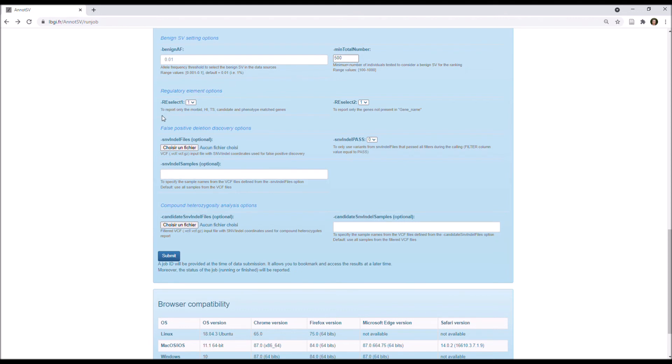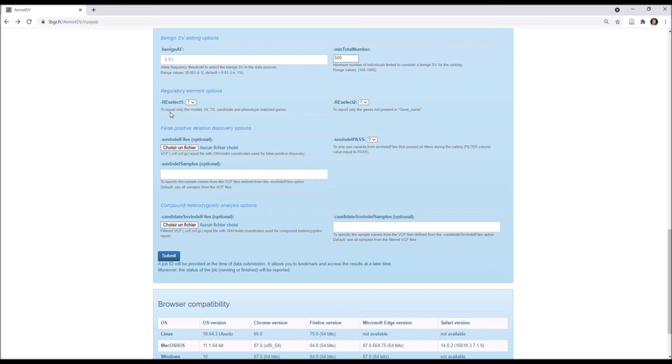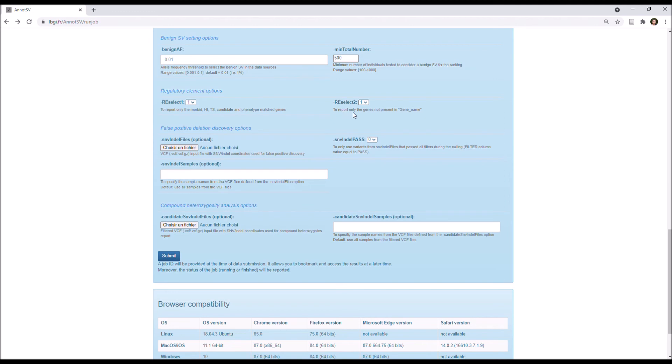Well, you also have options specific to the regulatory element, so AnnotSV reports the list of the genes whose regulatory elements are overlapped by the SV, and since overlapping so many regulated genes is a problem, AnnotSV restricts, by default, the report of the regulated genes to highlight the most relevant ones, I mean to explain the patient's phenotype. So, by default, only the morbid, haplo-insufficient, triplo-sensitive, candidate-on-phenotype-matched genes are reported, and also, by default, only the genes not present in the gene-name column in the output are reported.